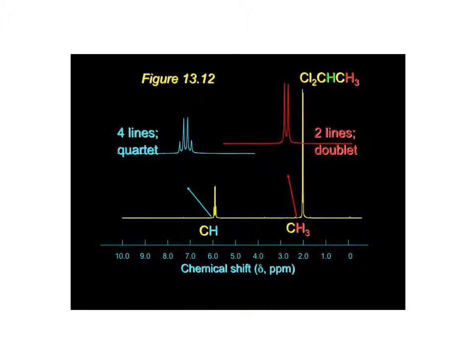Okay, so if we looked at this, I would expect you to be able to name this one. This is 1,1-dichloroethane. And they're not showing the TMS. If you look close enough, there's a little tiny blurb right there at the 0, but we would just draw that in and write in TMS, there's where the TMS would be, because that's your reference point.